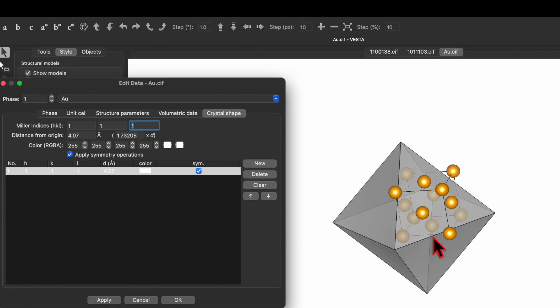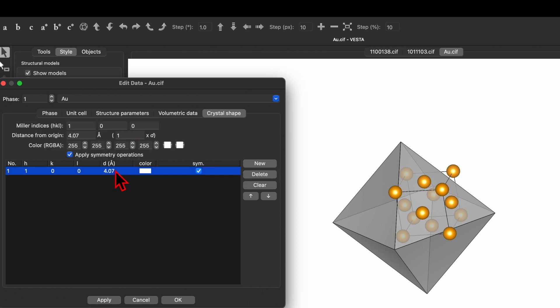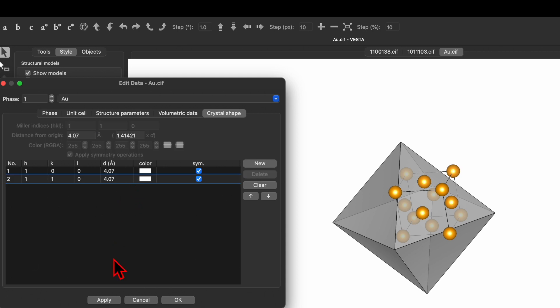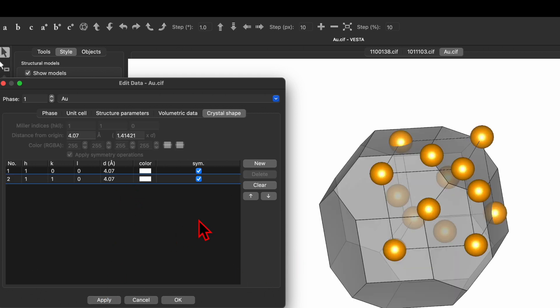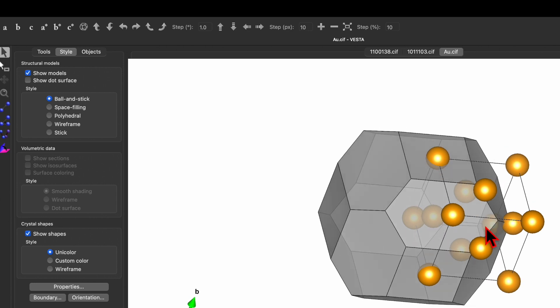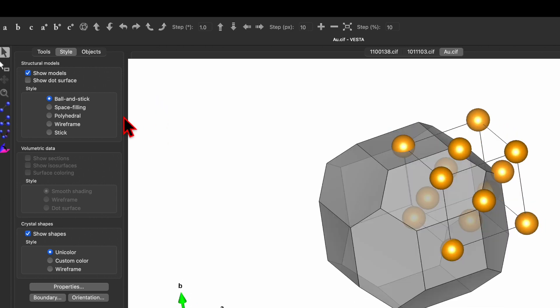We can also do a combination of different planes. Let's consider 1 0 0 and click New to add one more plane, this time changing it to 1 1 0, then Apply. You'll see the combination of these two planes creates another type of crystal shape with different faces along different planes. Click OK.